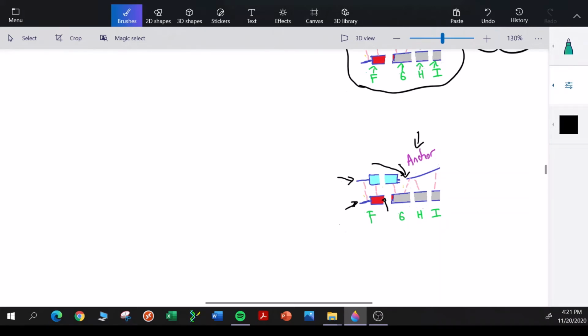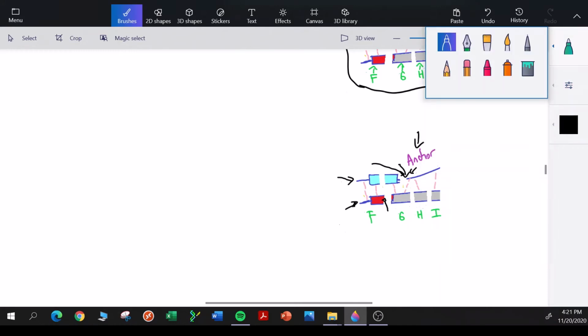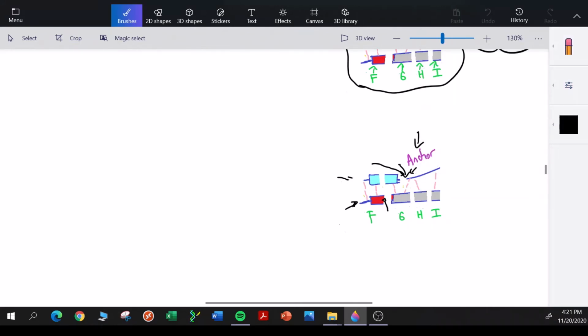another in the solution. So if we focus in on the anchor, any end that is too far away from the anchor is less likely to be connected to the anchor than an end that is very close to the anchor. So let me erase this piece right here, because we'll say that's too far away. That segment is not likely to be connected to the anchor. And neither is this one. It's kind of too far. I just want to go down to the 3 closest ends.